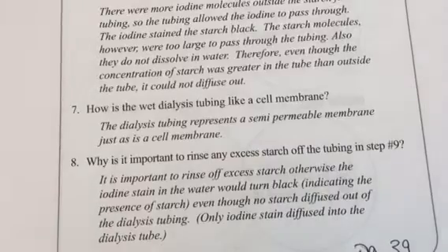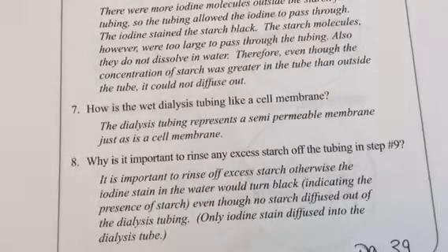And number 8, why is it important to rinse off the excess starch off the tubing in step 9? Well, if you don't rinse off the starch, then the starch molecules are in the water, and the water would turn black, indicating the presence of starch, even though the starch did not diffuse out. So you don't want any starch on the outside of your tubing, or it messes up your results.